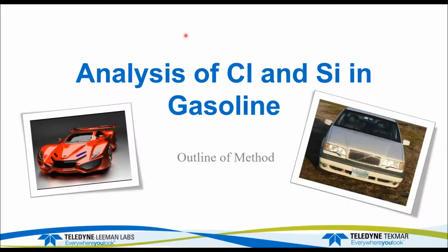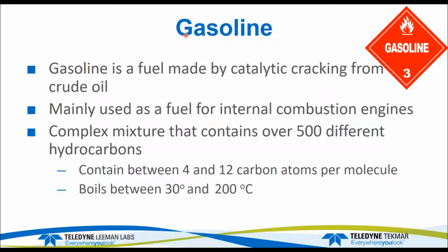Okay, and the final application is the analysis of chlorine and silicon in gasoline. This was done for some users that we have in China. They were going to be requiring the analysis of chlorine.